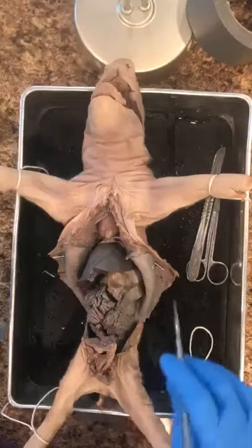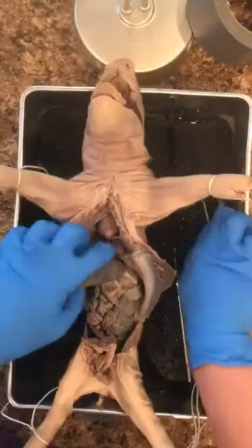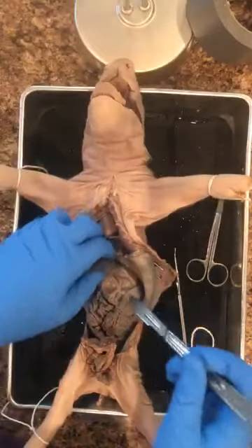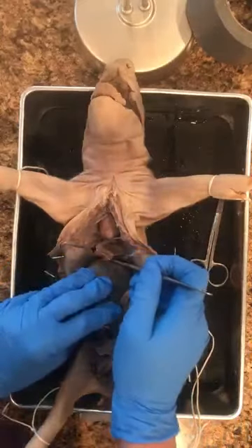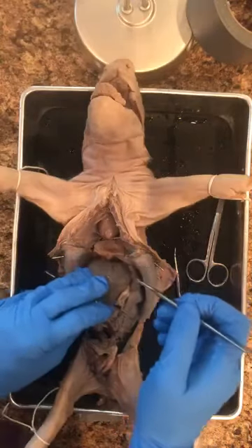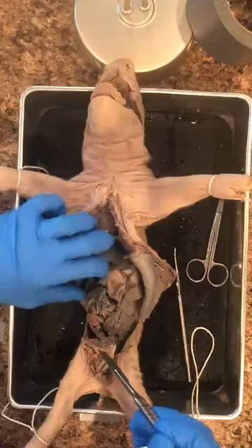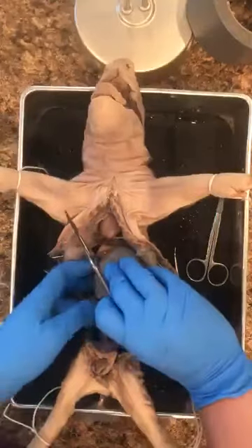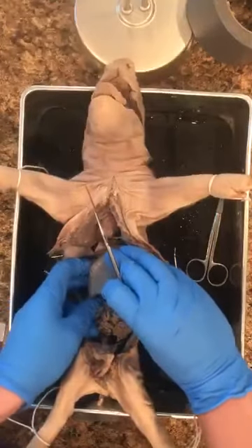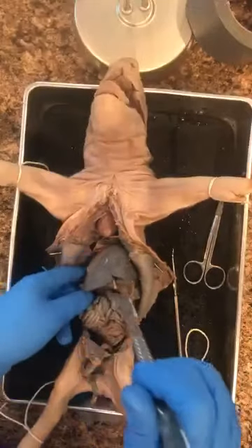So now I'm going to try to remove the entire liver and the gallbladder and try to keep it intact here. Remember, these are accessory organs. So the food does not directly go through either the gallbladder or the liver. They just help with digestion. Oh my goodness.